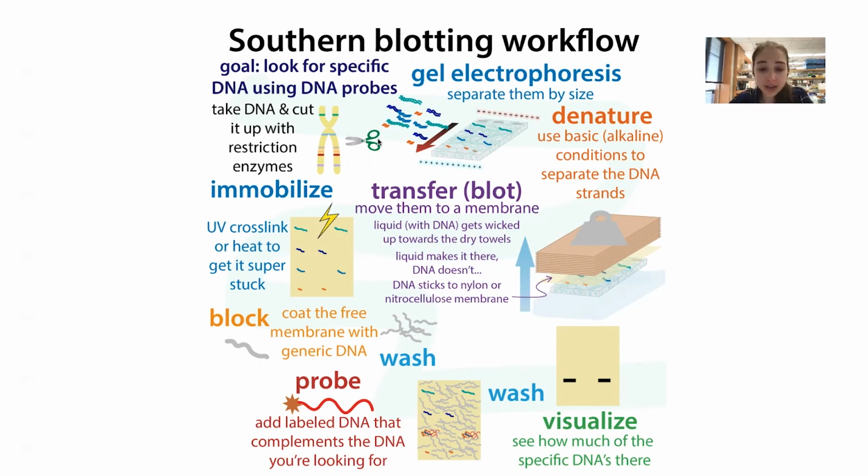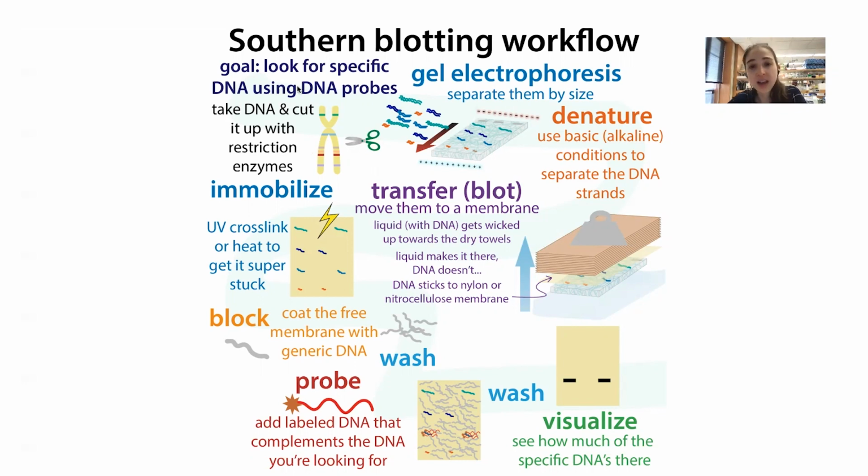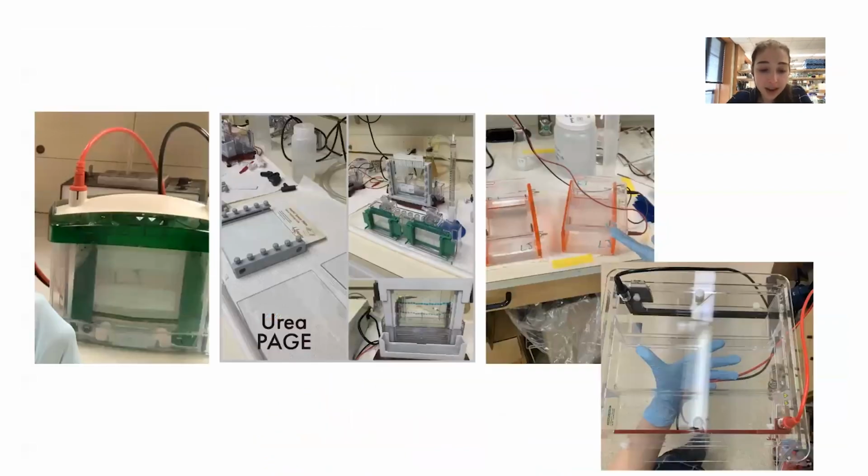And so we can cut it up using restriction enzymes, these sequence-specific DNA cutters. We use ones that have a fairly generic-ish sequence that they cut at. There are ones that are typically used to give you a size that is compatible with the technique. So you cut it up into those pieces, and then you separate them using your gel. And so now we've run our gel, whatever type of gel we've run, we've stopped it, and now the molecules are stuck where they are in the gel.